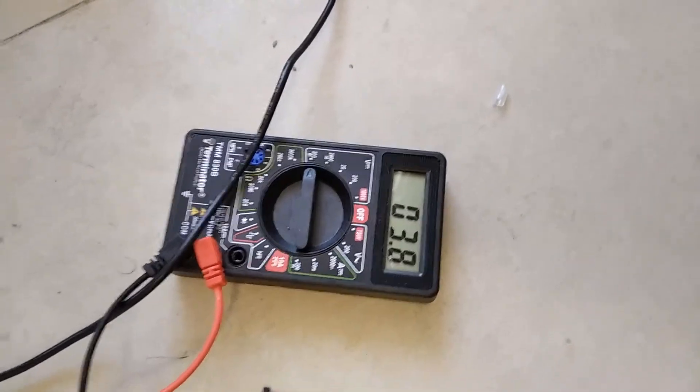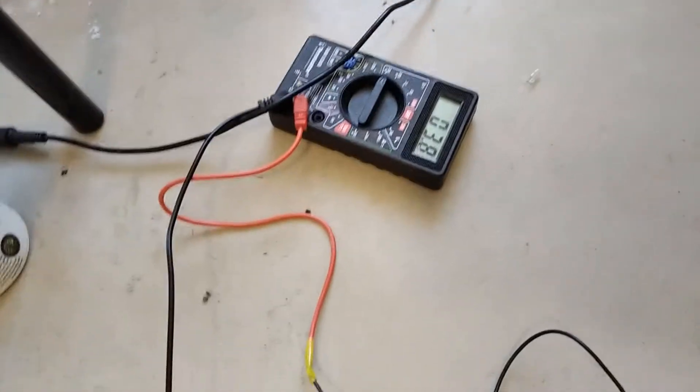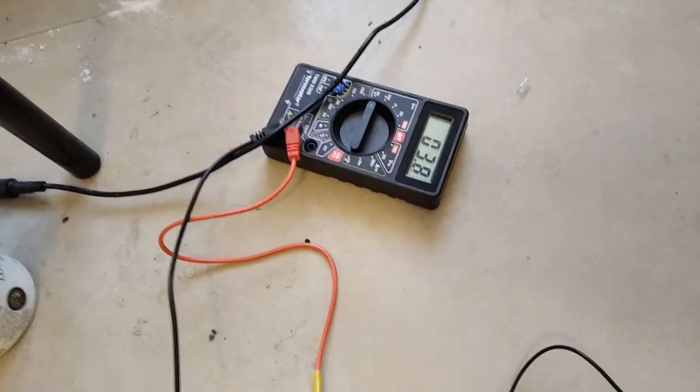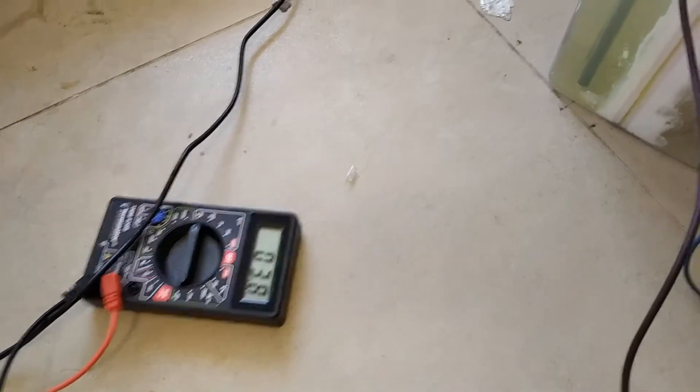Over here, the current reading is actually just the voltage of the shunt, which is the two points in this wire, and I have to divide that by a certain number. I think overall that's 1.5 amps — it's not very much, but that doesn't matter.